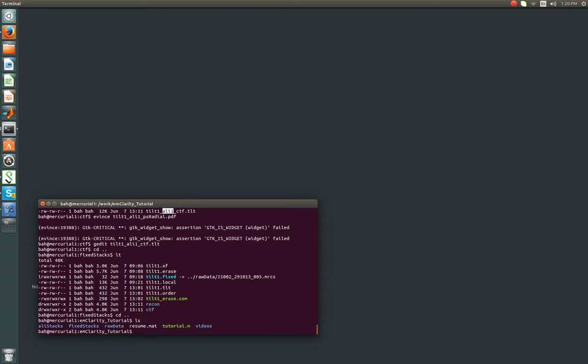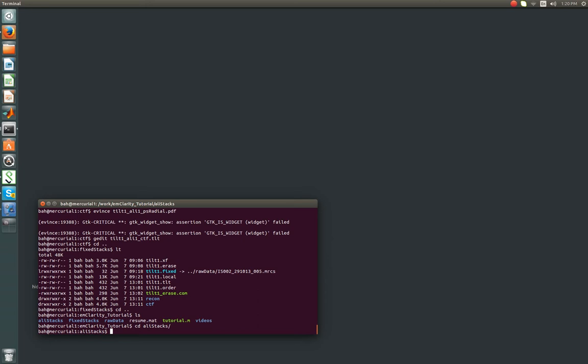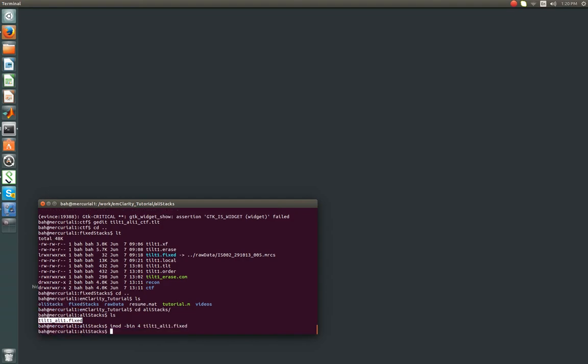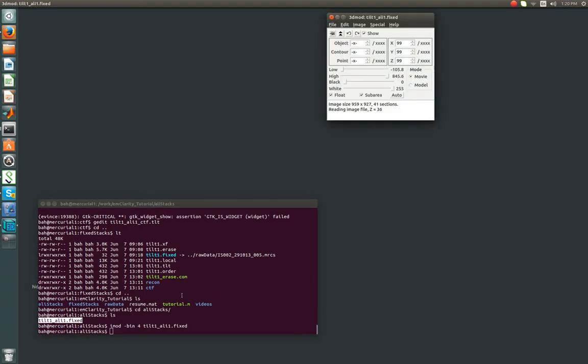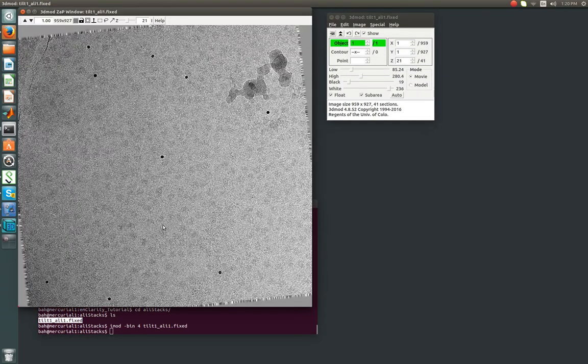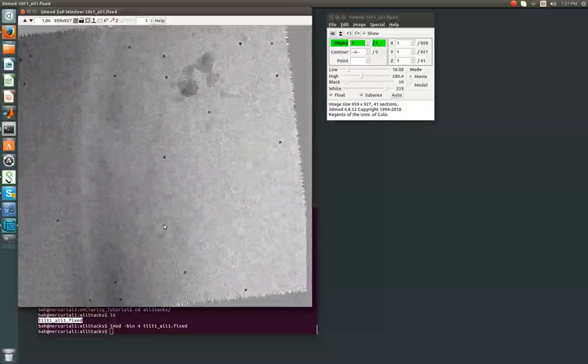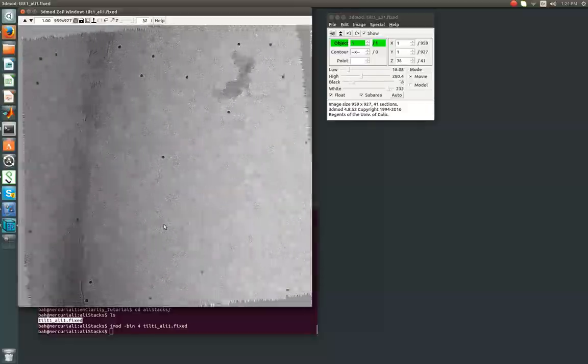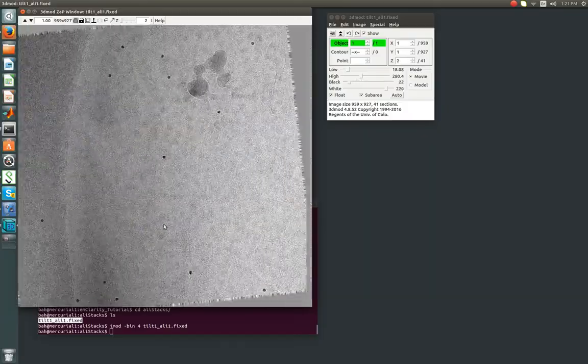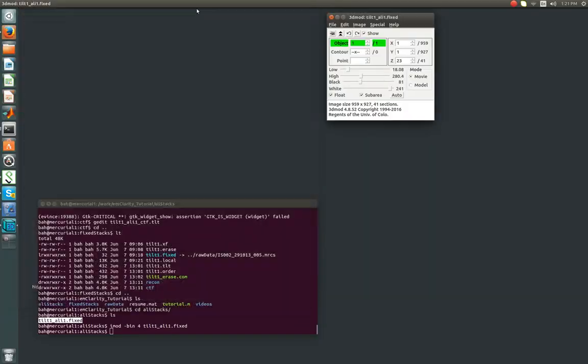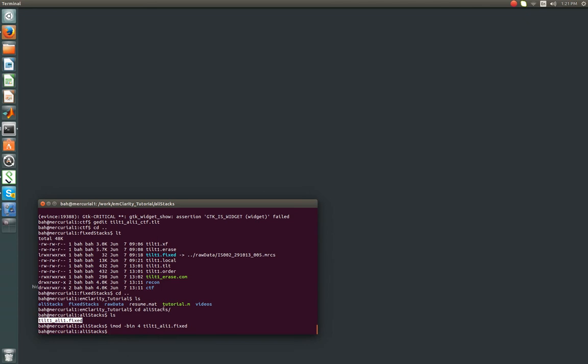One other thing happened while we were running that is this new directory popped up called aliStacks. So what that is is whenever you do the CTF estimation, it is one of the ways that EMClarity will use to apply the transformations we found in IMOD or later that we refine in EMClarity to create an aligned stack. So I'm going to open that at a binning. And all this is, is instead of now being tilt1.fixed, it's called tilt1_ali1.fixed. And it's the same tilt series we had, but now it's with the alignments that we had in IMOD. So now that we've got this file, and you should do this also for tilt number two, we'll be able to move on to actually setting up areas that we want to reconstruct, and from there moving on to template matching.